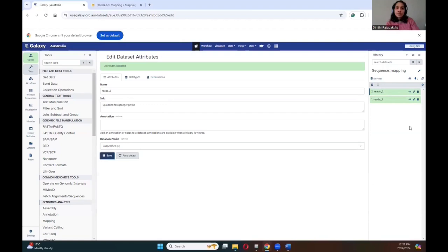Ideally the next step is to do quality control and trimming, but in this dataset they are pre-processed. If you want to learn more about quality control, please refer to the quality control tutorial in Galaxy.